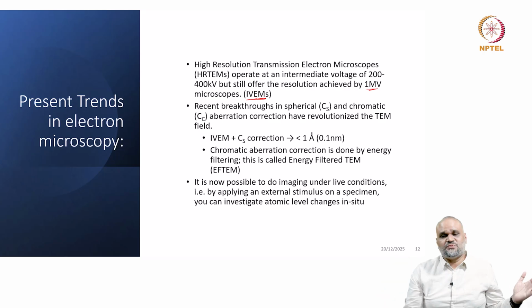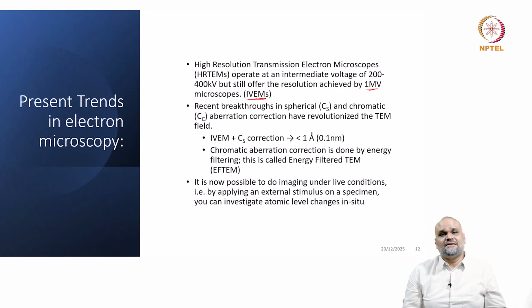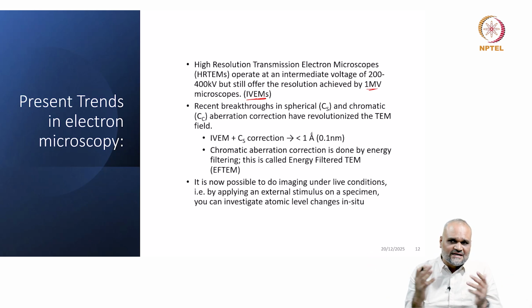So from a stage where we were looking at improving the resolution and breaking the 1 angstrom resolution barrier, we are now trying to use microscopes as tools where you can manipulate matter, change the sample, get complementary information from various techniques, do in situ imaging, do correlative microscopy, and also bridge two different techniques together.